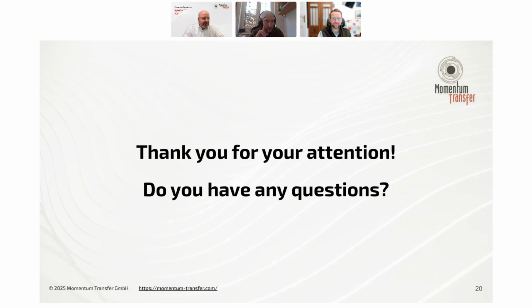In the parameter vertical, please choose from file instead of from sample. I am not entirely sure what this means. Yeah, the user is asking if we can upload files and not just use files from our system. I think Maxi showed it: you upload data into the search match tool. So I think that counts as answered. Yes, you can use external data for the tool.